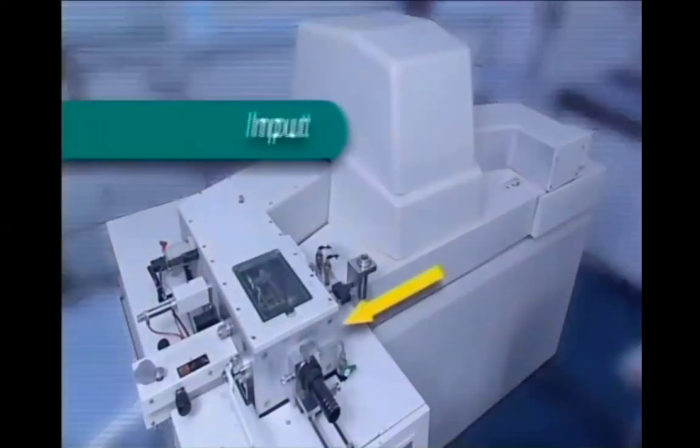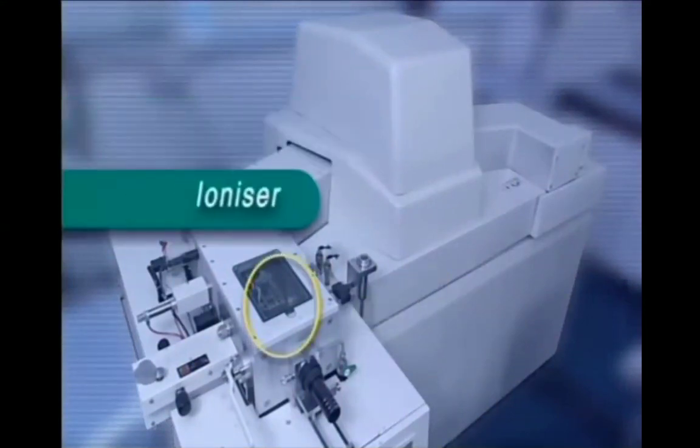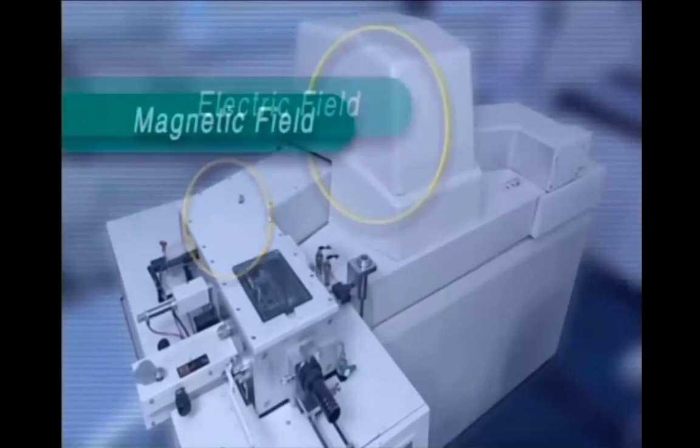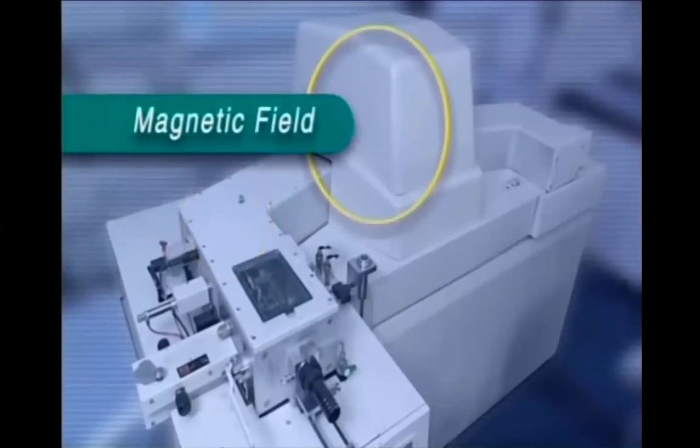The sample is introduced here, and the positive ions are formed here by bombardment of the sample with a beam of electrons. The ions are then accelerated by an electric field and then deflected in a curve by a further electric field. They then bend through a magnetic field and are further deflected by another electric field here.